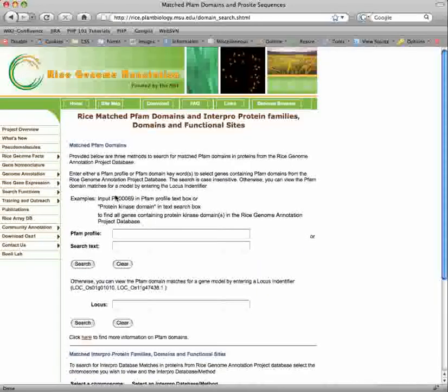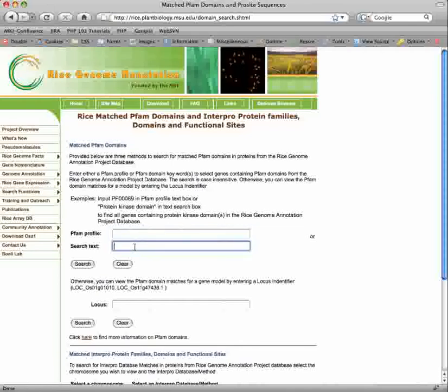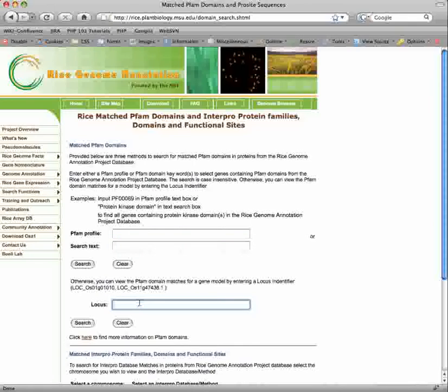Links to the sequence in Genome Browser are also provided at the top. You can search our annotation for PFAM domains and InterPro protein families, domains, and functional sites. For the PFAM search, you can input either a PFAM profile identifier or use a text search of PFAM domains. Alternatively, you can find the domains on a per-gene model basis by inputting a locus ID.